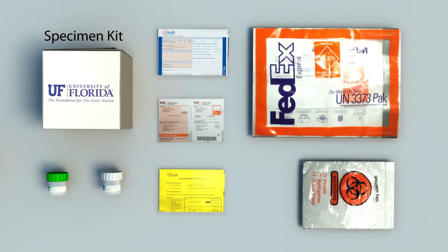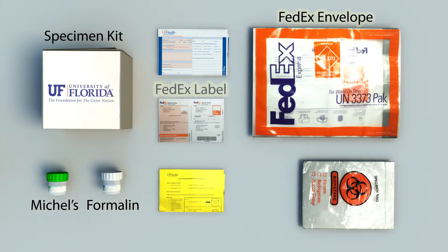Each specimen kit is comprised of two fixatives: formalin and Michel's. Also provided are prepaid FedEx return envelopes and labels, which include a Saturday delivery sticker for the occasional Friday send-out. A requisition will be folded and placed on top of the specimen containers inside the kit.